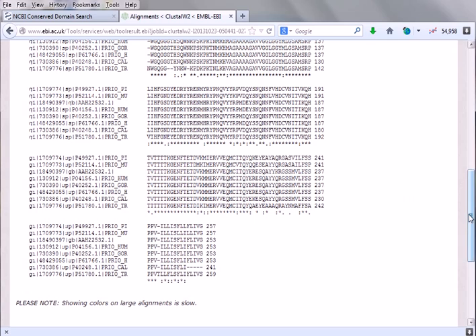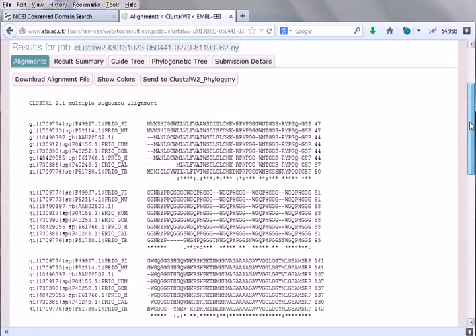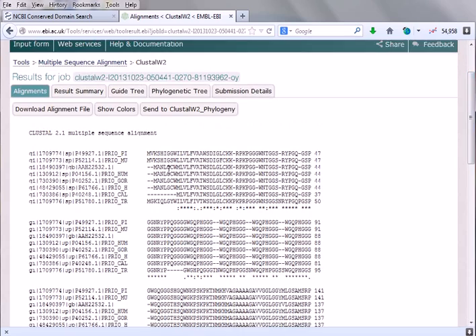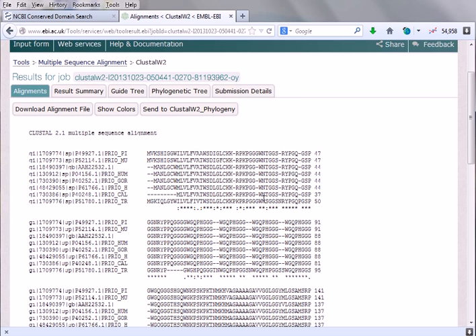Star means they are very good, they are full match sequence. We get a pretty good alignment. In alignment we can get match, we can get mismatch, and we can also get gap. Here it says in any kind of single dot or double dot you can find a mismatch. Here it is a T, and next to it it's an S, so it's a mismatch.